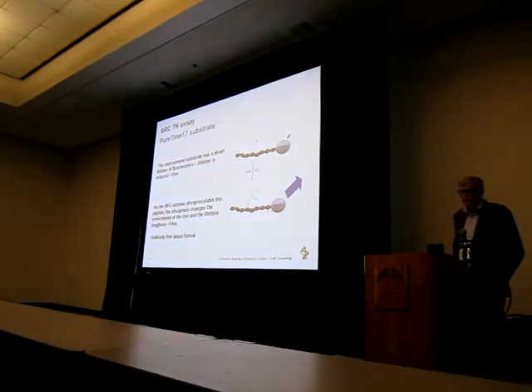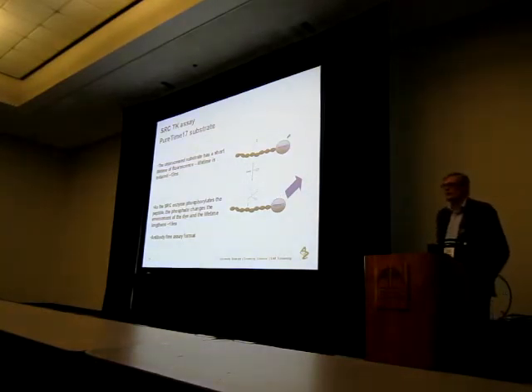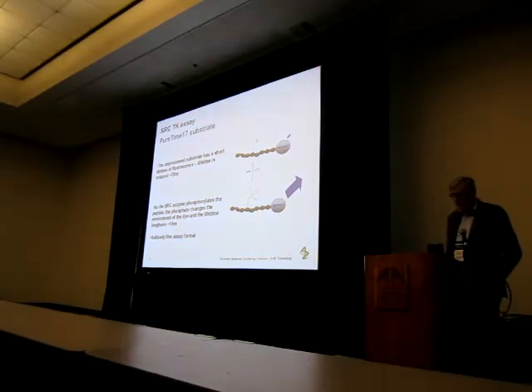So this, very briefly, is something you can get from the Assaymetrics website, which of course is where I stole this from. I'm more than happy to pinch other people's ideas. As you can see here, we've got a peptide substrate with a PURETIME 17 dye attached to that. In the native form, when it's unprocessed, it has a relatively short lifetime.